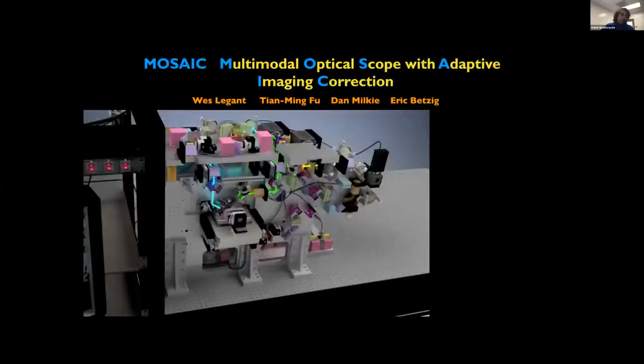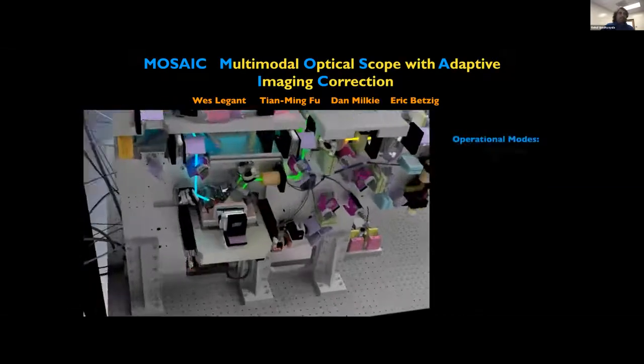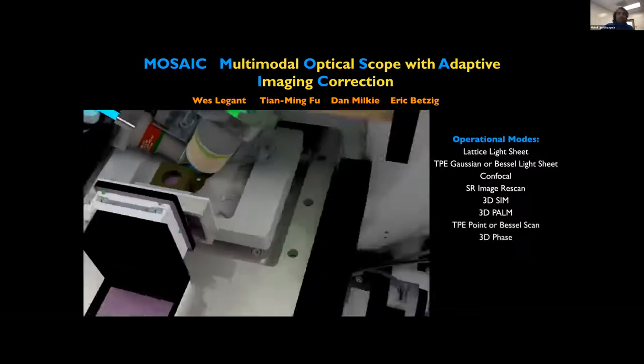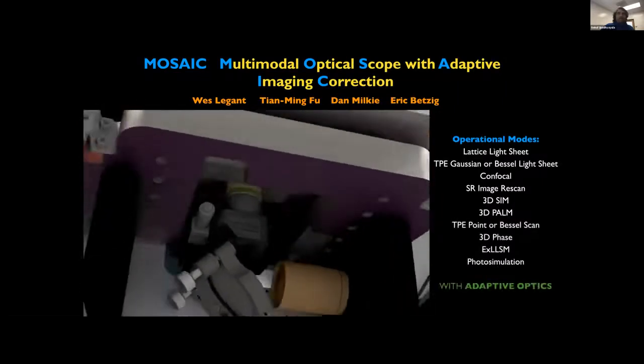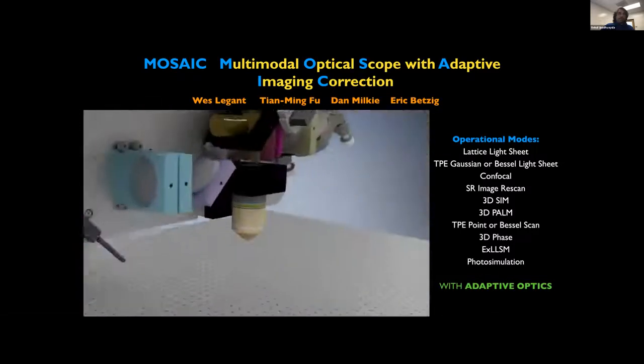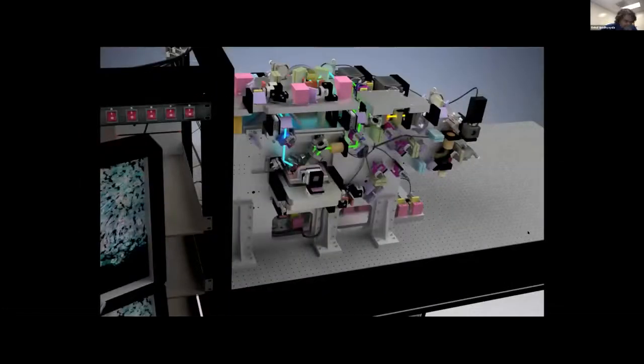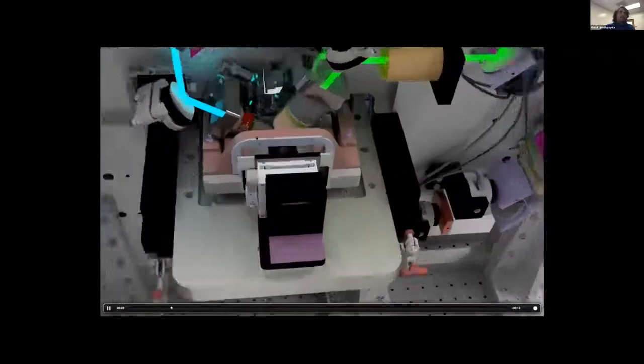And then we figured, well, why not just reuse these optical components and design a system such that we're able to leverage one microscope that reuses all of these elements to have the functionality of about 7 to 10 different microscopes. And the added benefit is that because we have more things, we can basically impute everything with adaptive optics if that particular imaging mode is able to leverage that. So this is basically what we've designed and built. This has 3 imaging stations.